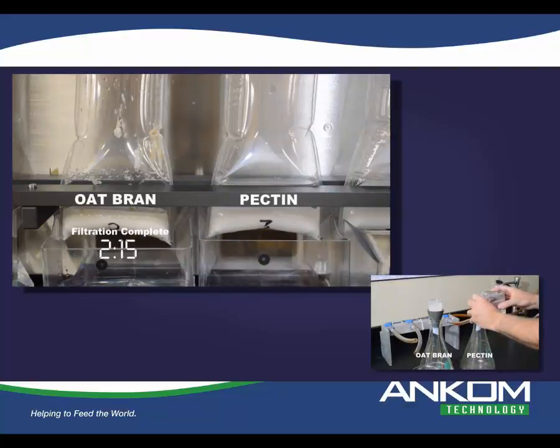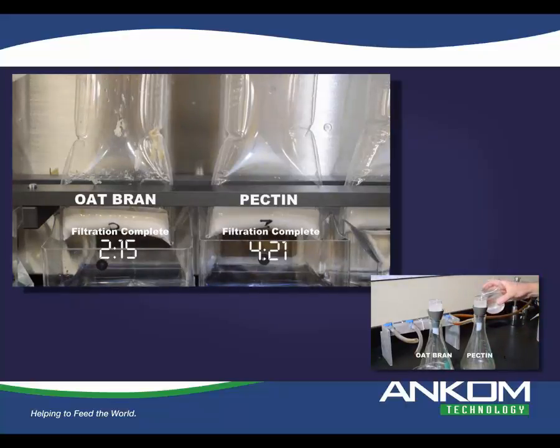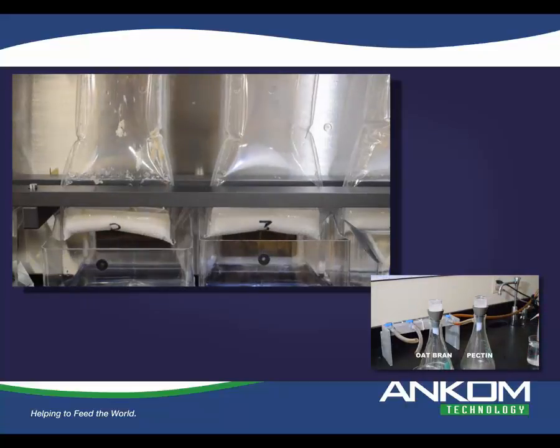You'll have enough space. However, when you do the filtration of the precipitation phase, you're talking in excess of 350 milliliters that's being poured into a 60 milliliter fritted disc. And so you have to constantly be there to keep adding it on as it filters.